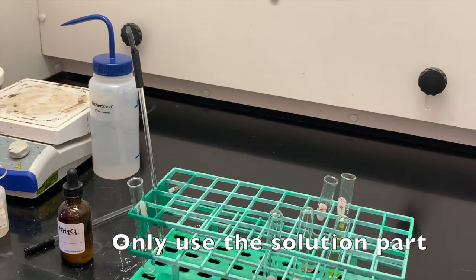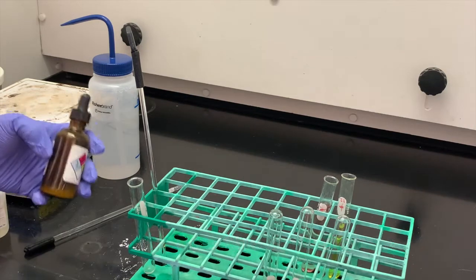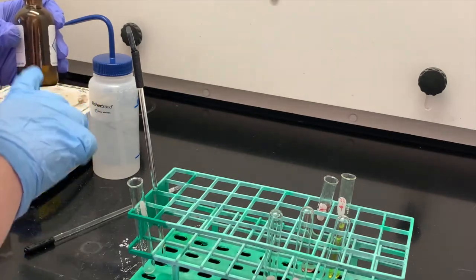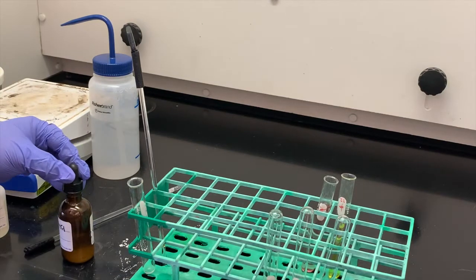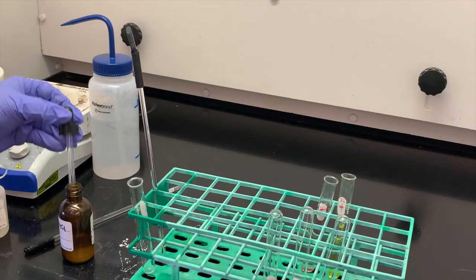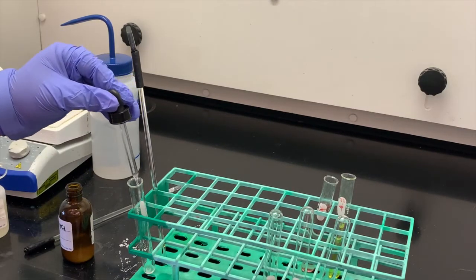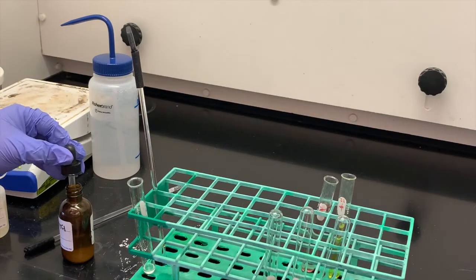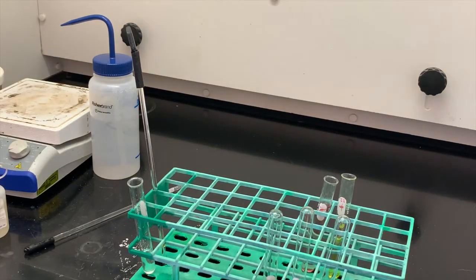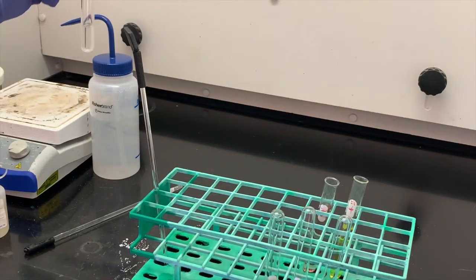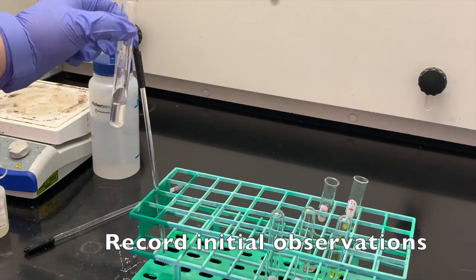So be careful with the dropper to only pick up the solution part, not pick up the solid. I'm going to add about two milliliters of that to my test tube. And then you want to record your observations for this ammonium chloride.